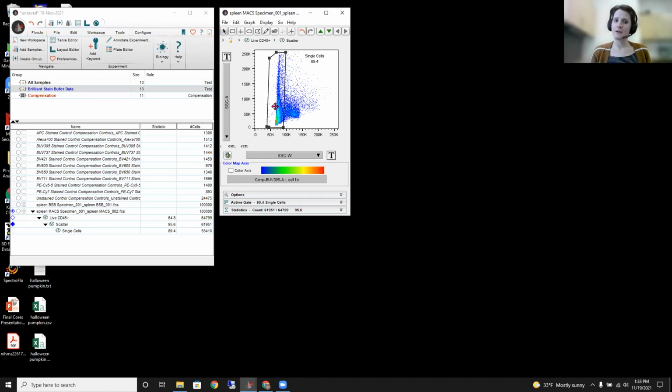Yeah, absolutely. Like, for example, I believe on the Cytoflex, you only have the capability of looking at width off one detector. So you're not going to have the options like you have here to play around so much. So it really is absolutely dependent on the instrument that you're working with and the cells and how they resolve on that instrumentation. I think the important thing that we'd always say is it doesn't matter which way you do it, it's important to do it, because otherwise you're running the risk of not doing single cell analysis anymore. Exactly. And remembering that a negative cell and a positive cell stuck together is going to look like a dim positive, right? So we might be looking at our data and not realizing that we're falsely generating a population that's not real.